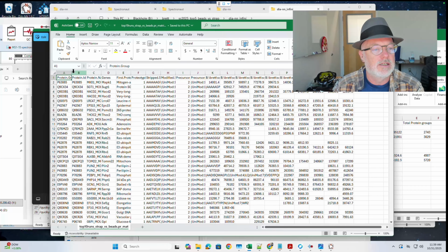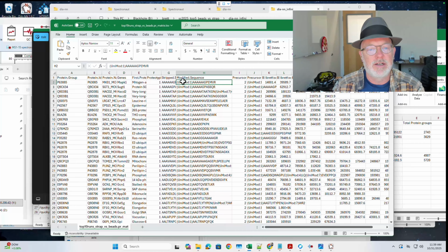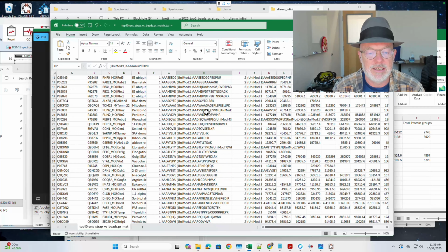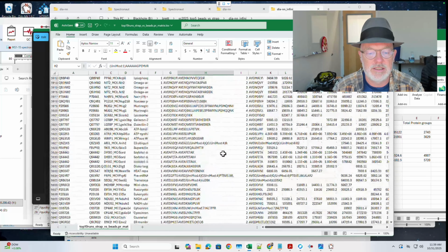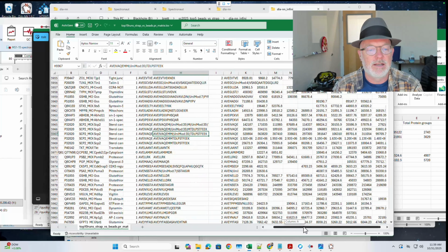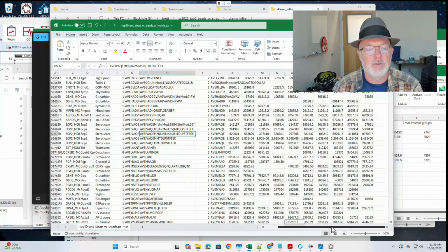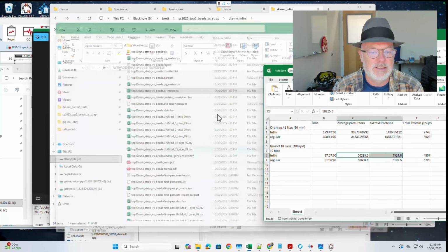Let's see. So you can see here under modified sequence, there's that Unimod 1, and that should be that alanine at the beginning, and you'll also see probably some 7s. Let's see, here's 35, oxidized methionine. It tells you this methionine right here is oxidized. And so that's kind of cool. So you can actually get the site here. Okay, that's neat. All right.